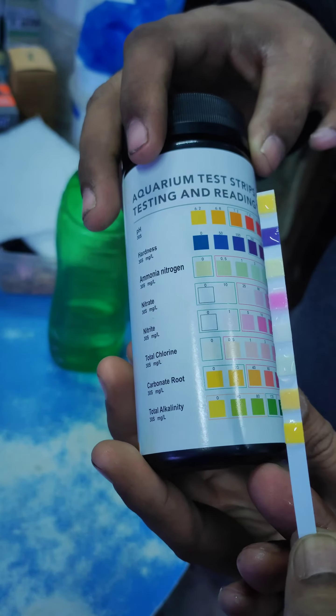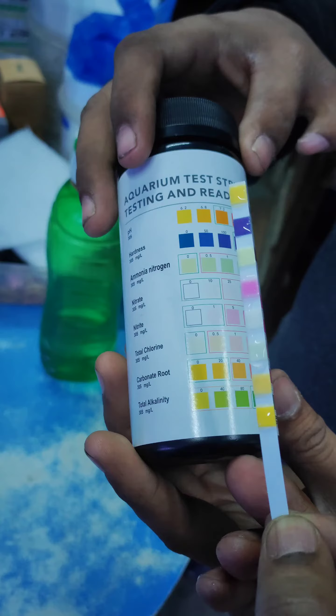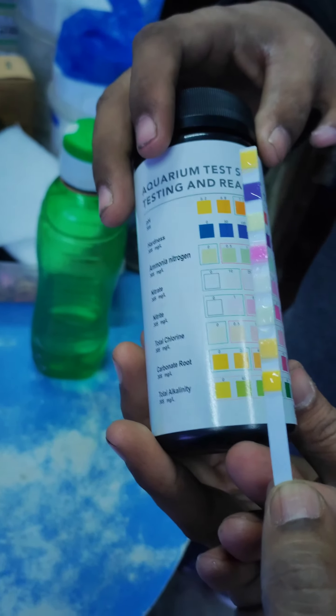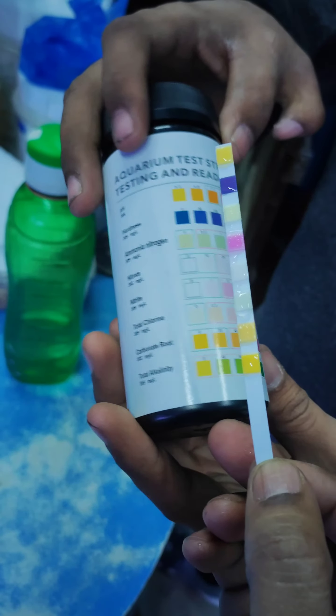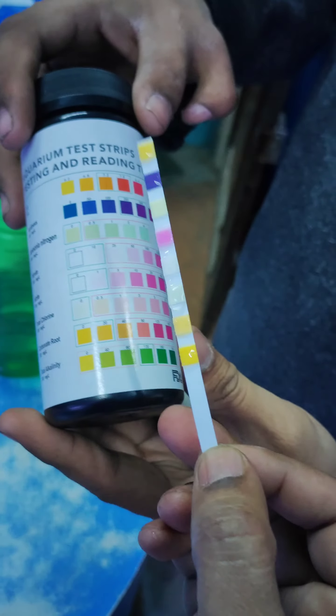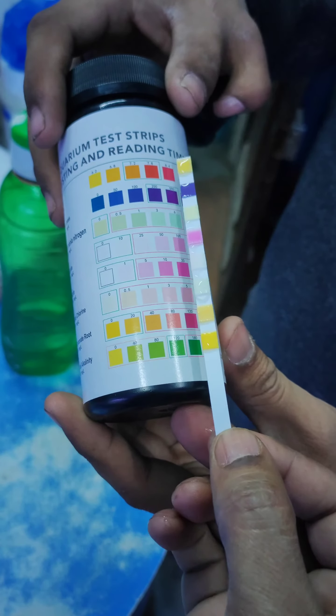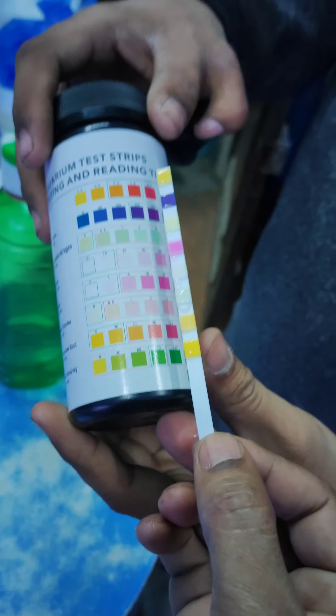See, pH is normal which it should be. We can see nitrite, ammonia nitrogen — nitrite seems a little high. We need to do some water change. It's because of the poop.